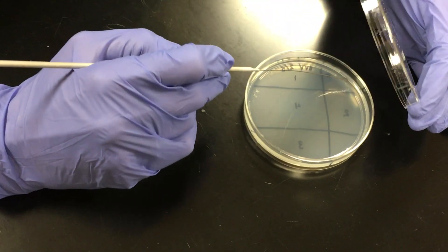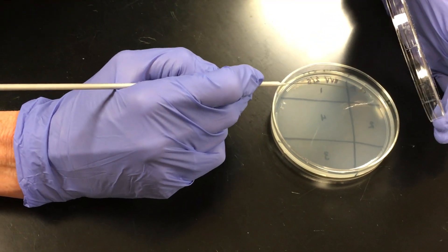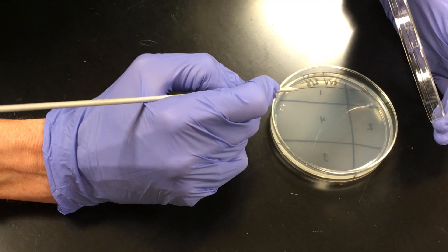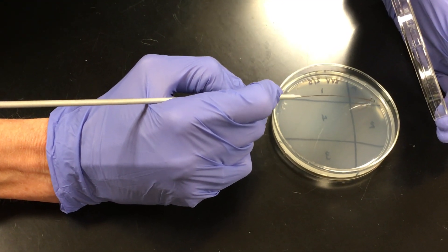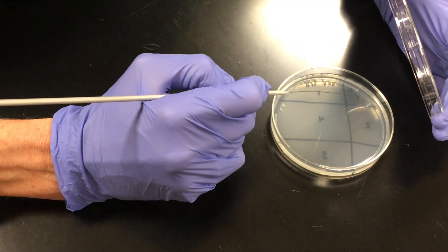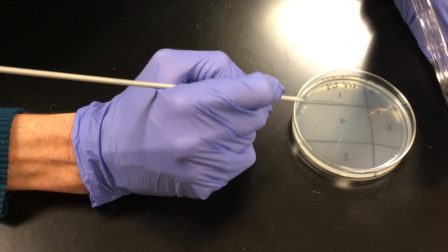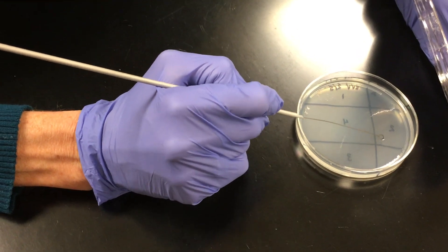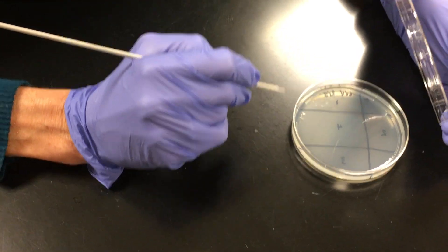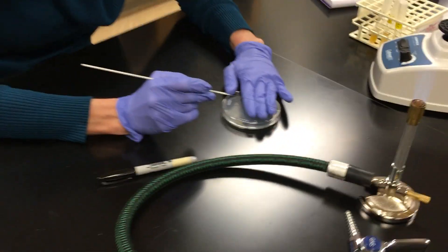Now what I want to do is I want to spread the bacteria over here from quadrant one across quadrant two. So I'm going to put my loop down. And I'm just going to gently streak one, two, three, four, five. And notice I never crossed into any of the other quadrants. I didn't cross over my lines. And then you close your plate.